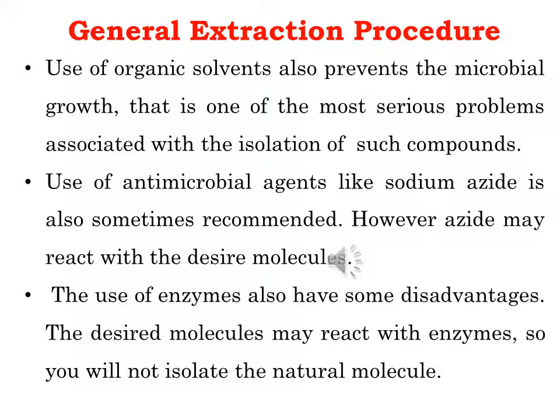But I personally do not recommend the use of azides during the isolation process because there is strong evidence that azides can react with certain molecules to form triazo derivatives. So if you are sure that your natural products do not react with sodium azide, you may use it. If azide is used for the preservation of gel columns or other supports, care should be taken to wash it out thoroughly before use.